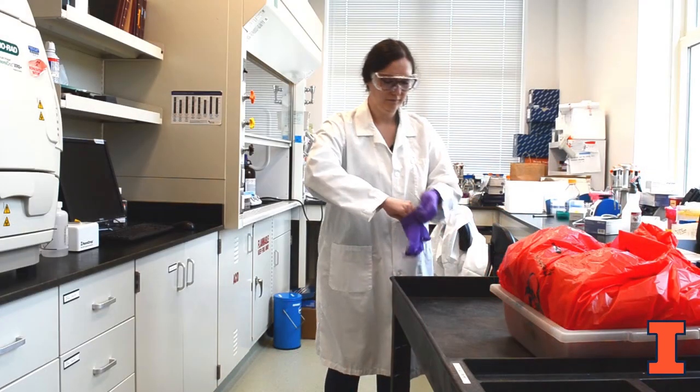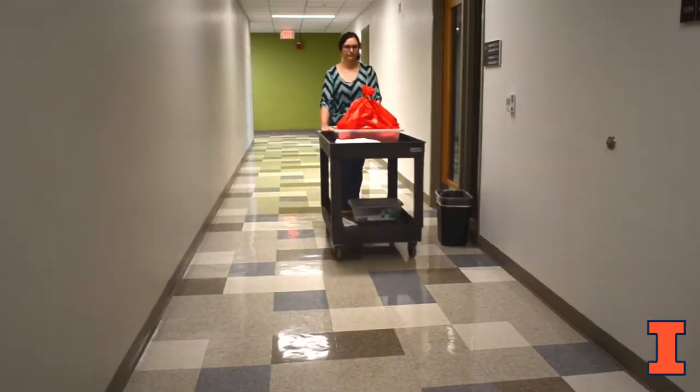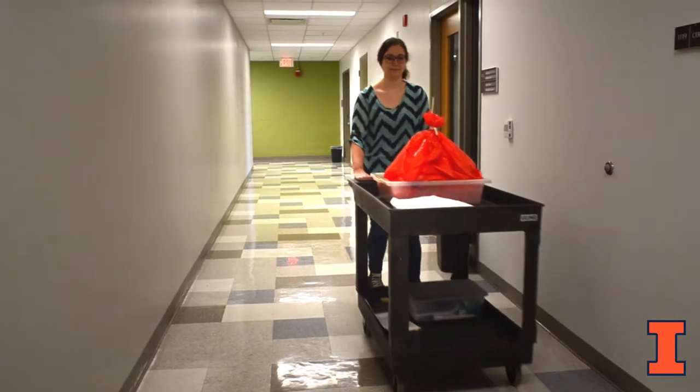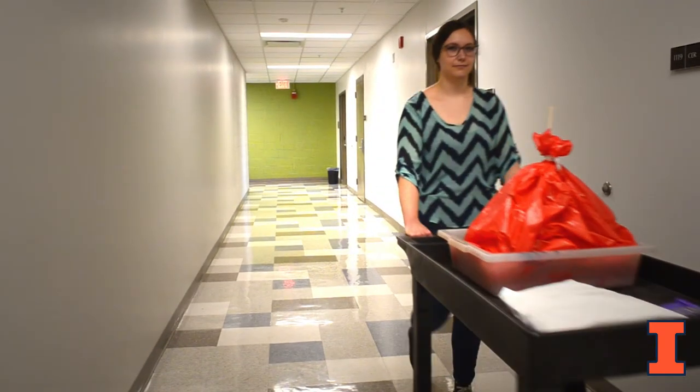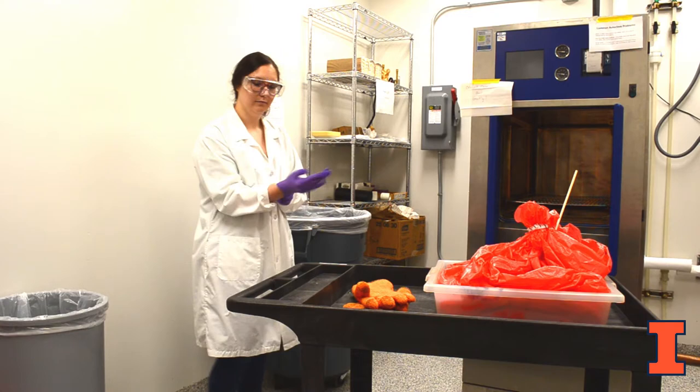Before transporting your waste to the autoclave room, remove PPE and wash your hands. Do not wear PPE in the hallway. A cart is recommended for transporting all items including sealed waste in a secondary container, a clean lab coat, disposable gloves, and safety glasses. Before handling the waste at the autoclave, don PPE.